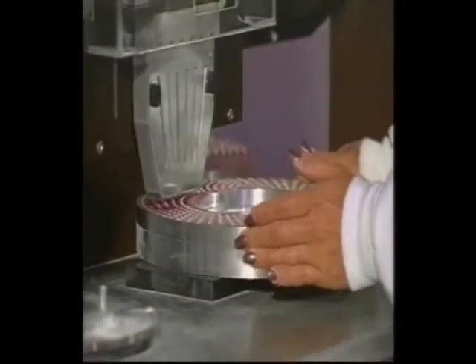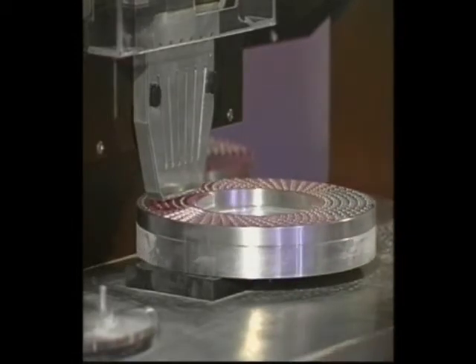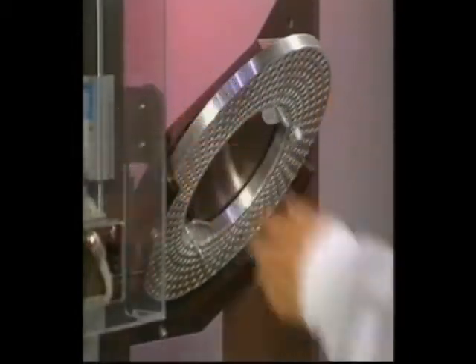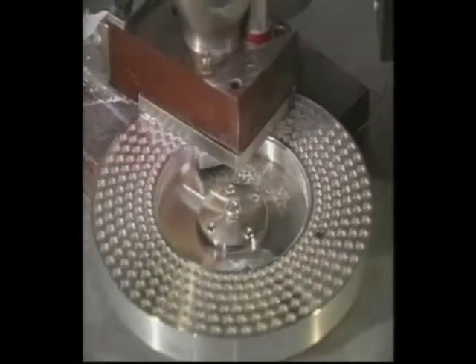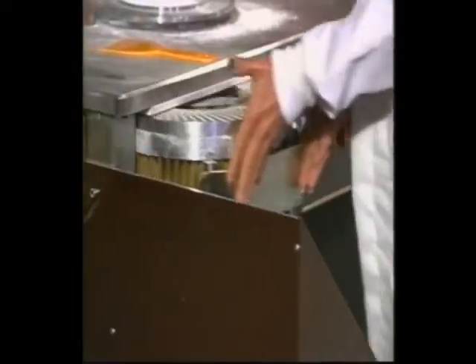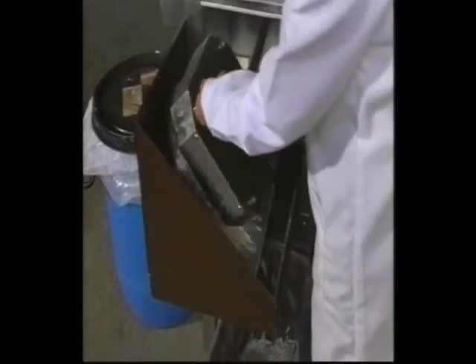The operation of the Model 10 follows some basic steps. You'll be filling a ring with empty capsules, separating a ring into two halves. The top half holds the capsule's caps, and the bottom half holds the capsule's bodies. Filling your capsule bodies with powder, putting the capsule cap and the bottom back together in the closing station, then ejecting the capsules from the rings.